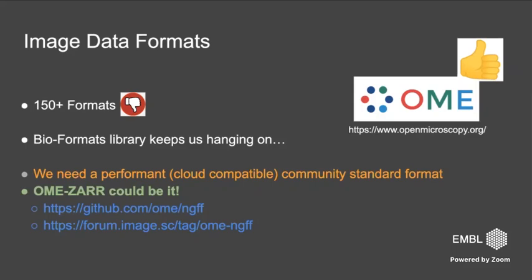Good news. A very good candidate for this is called OME-Zarr, and there is a GitHub repository where this is discussed, and also on the forum that I will discuss in a minute, you can follow with this text. So if you are a bit more of a techie person that cares about image data formats, please get involved here. It's, I think, an extremely important effort.